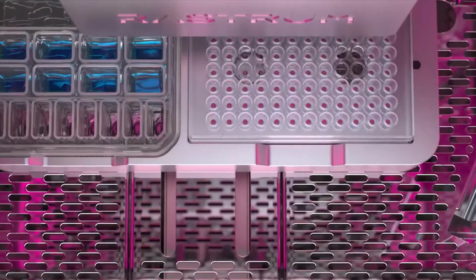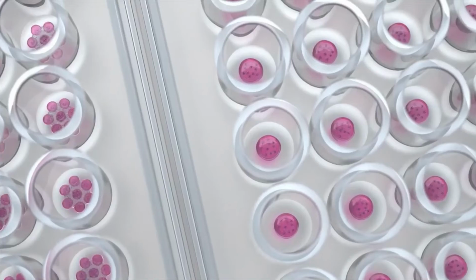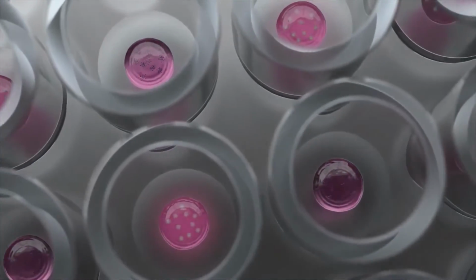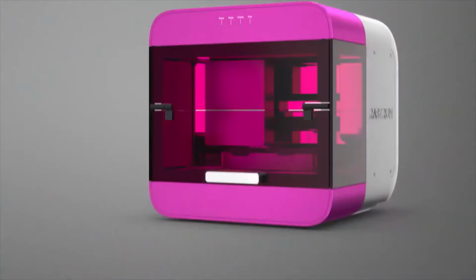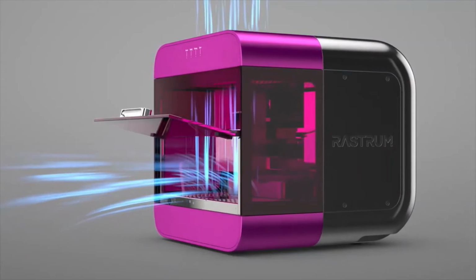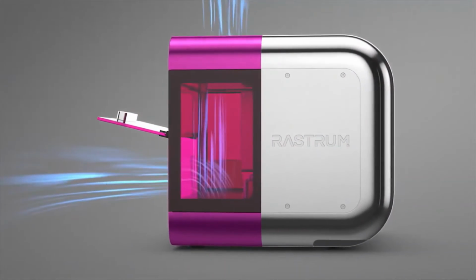Whether screening drugs or probing fundamental biology, printed cell models are compatible with standard imaging and assay workflows, and cells can be harvested from the matrix for downstream analysis. With an integrated laminar flow system and intuitive workflows, RASTRUM offers a complete benchtop 3D bioprinting solution.